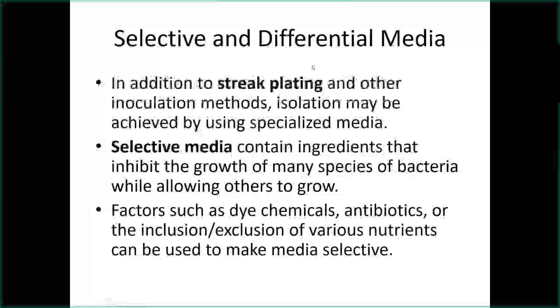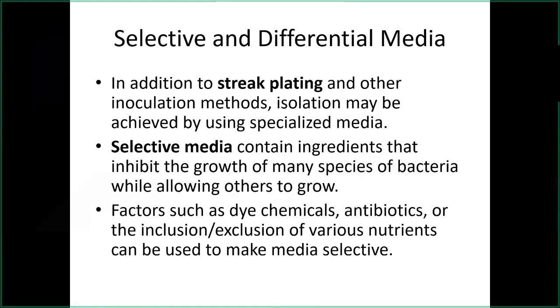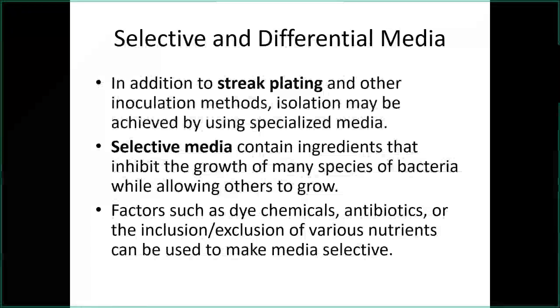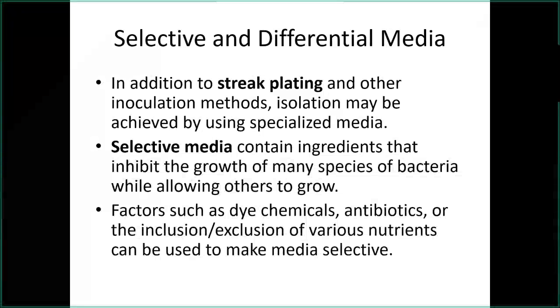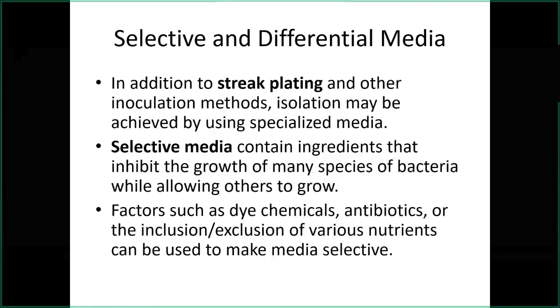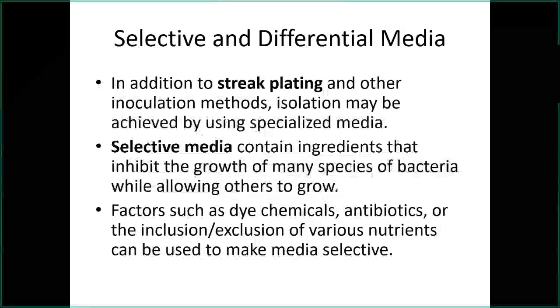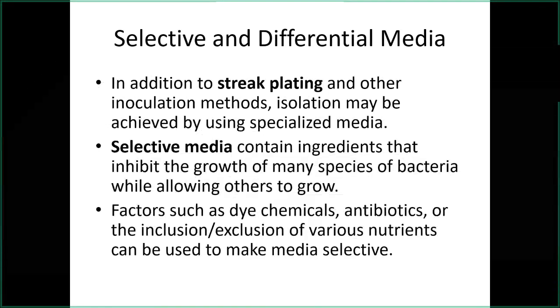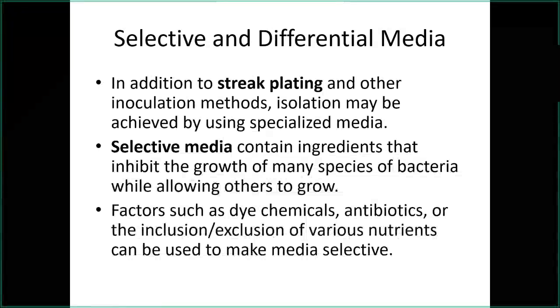You take an agar plate and apply a sample, and then in a serial fashion, flaming the loop in between, streaking serial quadrants, you ultimately spread the organisms out to the extent that you'll see individual colonies, and you can pick which ones you want to work with and culture them separately, and there you have it, pure cultures.